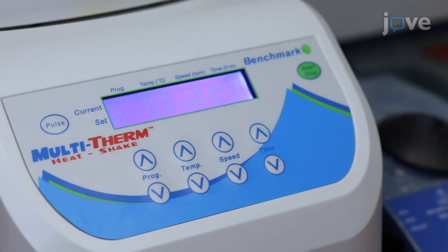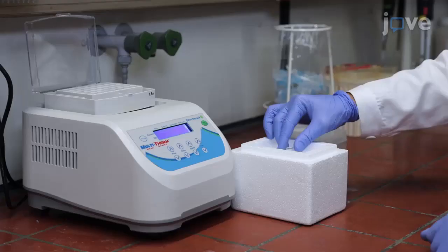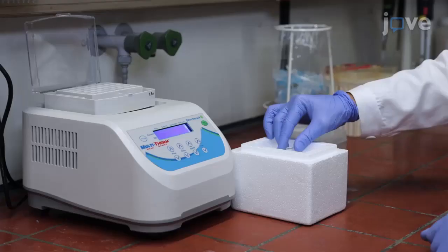Heat a thermoshaker to 42 degrees Celsius. Place the tube containing the bacteria in the apparatus and heat for 90 seconds. Then, place the tube on ice immediately.